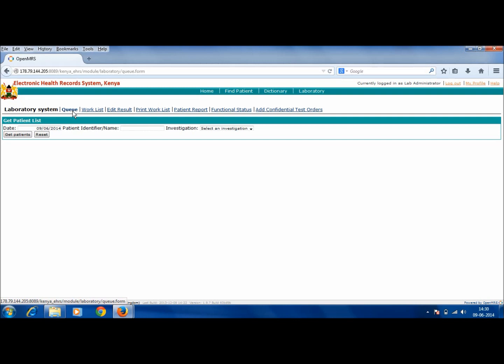For the indoor patient, the queue will directly come from the patient's dashboard and a consultative bill correspondingly will be maintained at the time of billing. Now to get the queue, select a date, which is by default the date of the day.